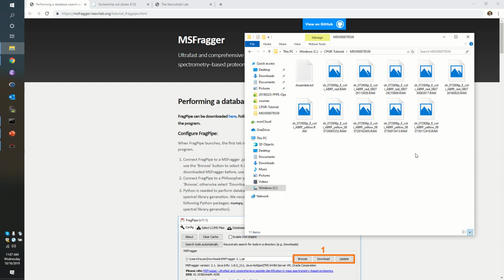raw files. So we have 5 quintuplicates of red E. coli and quintuplicates of yellow E. coli. And by giving everyone exactly the same raw data and giving everyone exactly the same sequence database, we thought we would remove a lot of the variability in which proteins people would call differential between red and yellow E. coli. It's a really fun experiment.